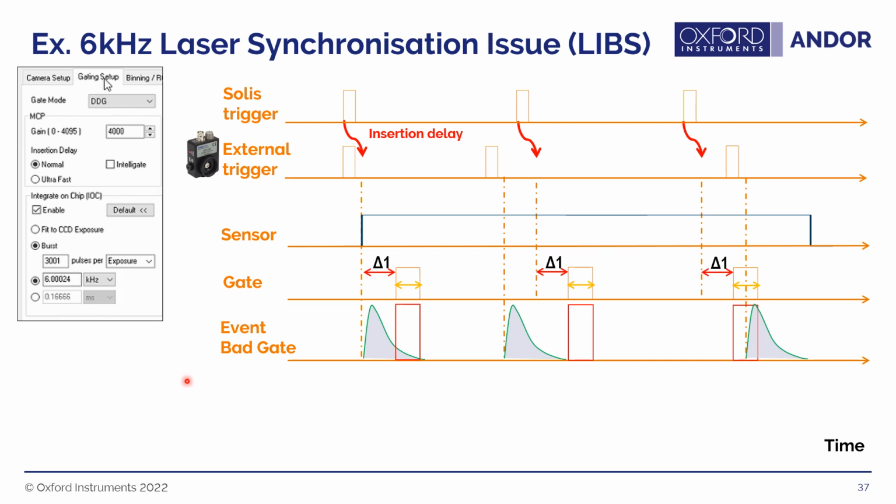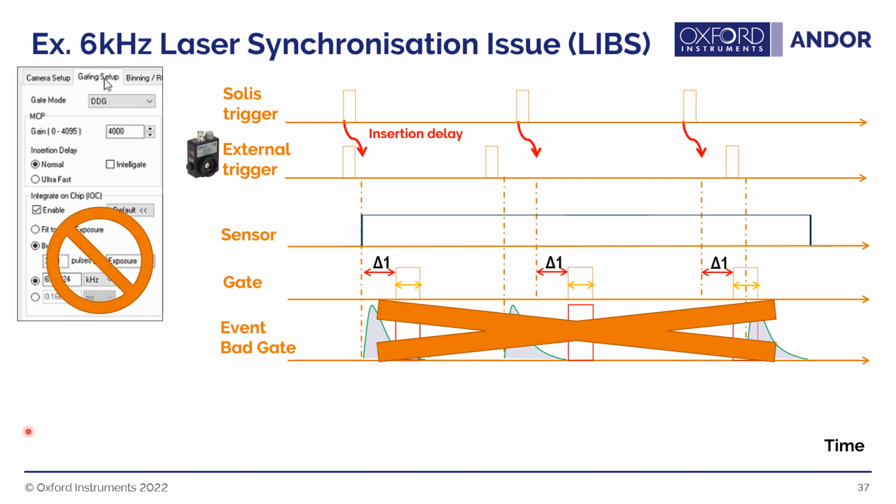And so when this customer wanted to look at different time delays individually, one acquisition at a time, what they were seeing was kind of a blurred average of this signal. And so they weren't really seeing this time dependence of their phenomenon. So we did some troubleshooting, went back to basic modes, proved that everything was working on the camera, and figured out, okay, what was really going on: the difficulty with this current experiment was we did not want to use this advanced mode.